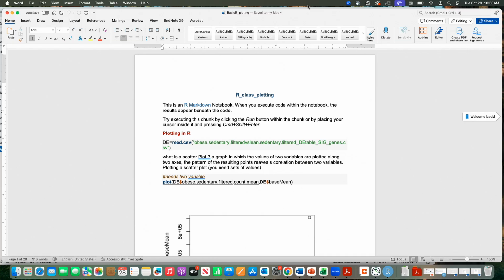Okay, let's actually start. I will be going backward and forward from the Word file to the Jupyter notebook and back. So R, unlike many other programming languages, where when you want to access a file you give a path of that file and any program can directly access it through the path. Like in Linux, if you are running fastqc, you say fastqc and then give your file name.